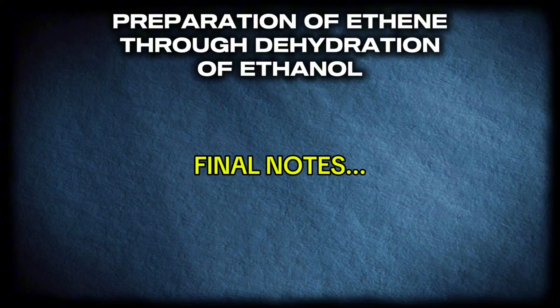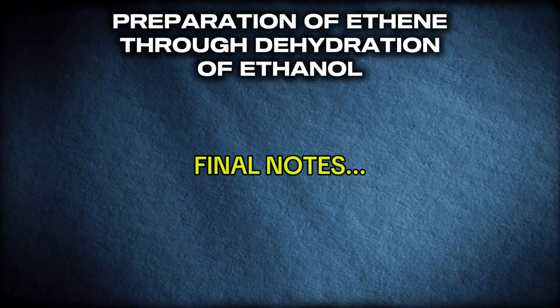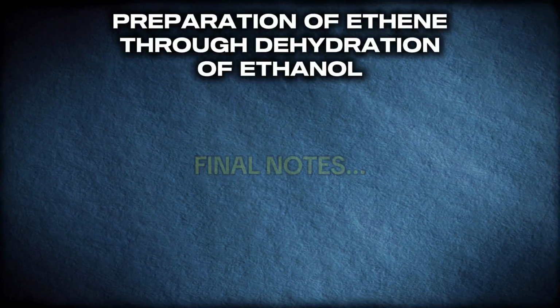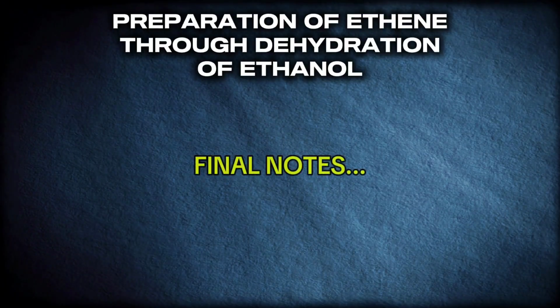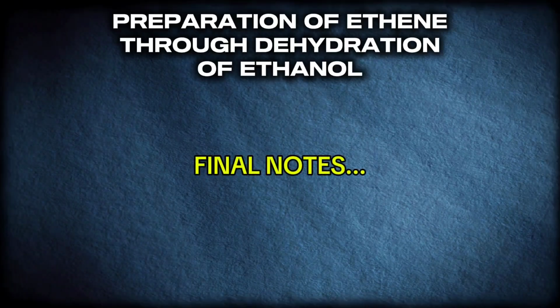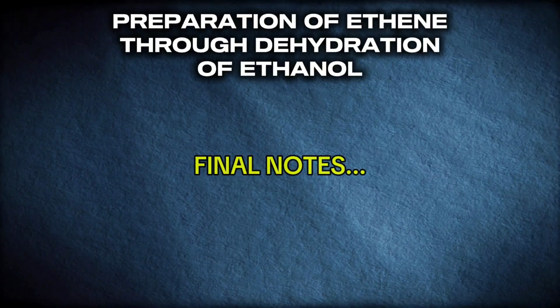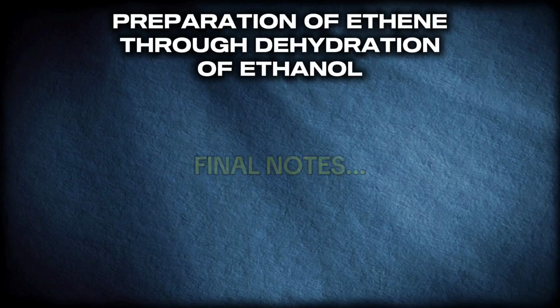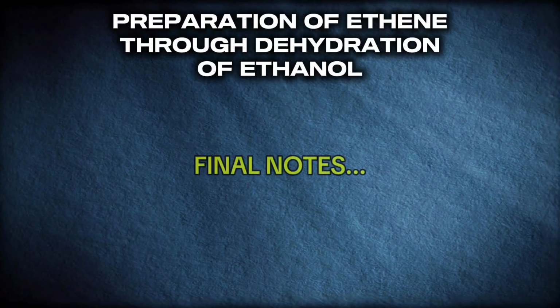Then this is followed by 2 precautions. Then you draw your conclusion. That is how you're going to report this particular experiment. And get to know why some of these have been used, like the sodium hydroxide. Why do we have to add sand to the mixture? Why do we have to heat over a sand bath? I've said that because the sand bath provides a gentle and even heat transfer in the system, thereby allowing the process to proceed controllably.